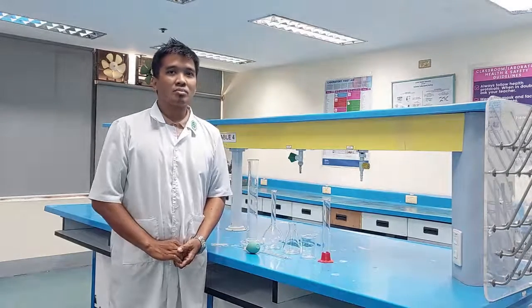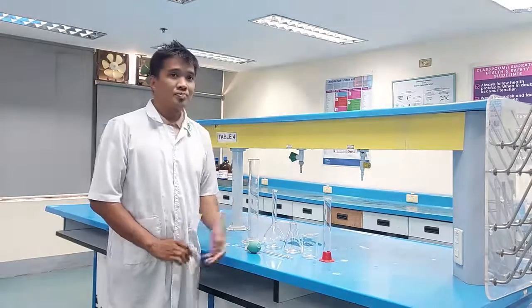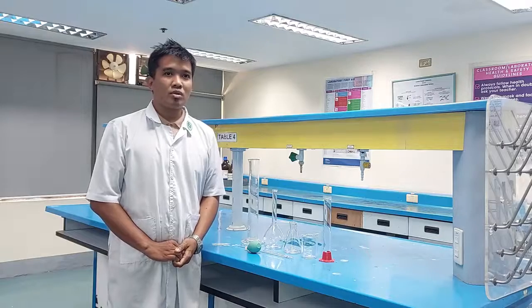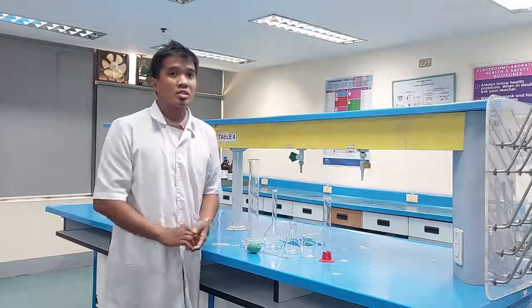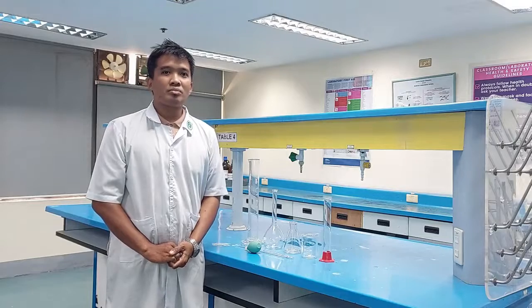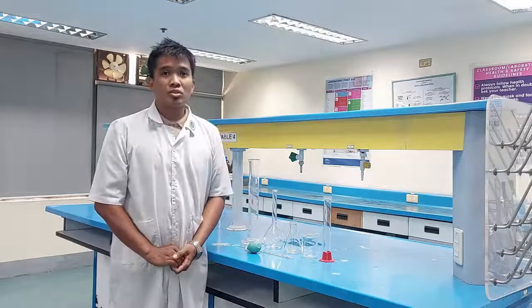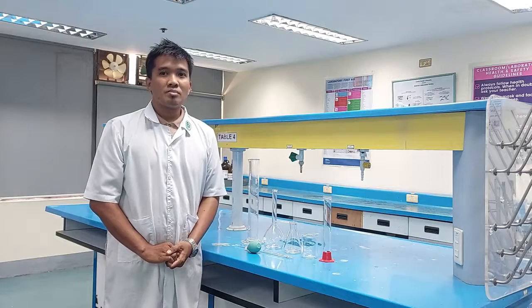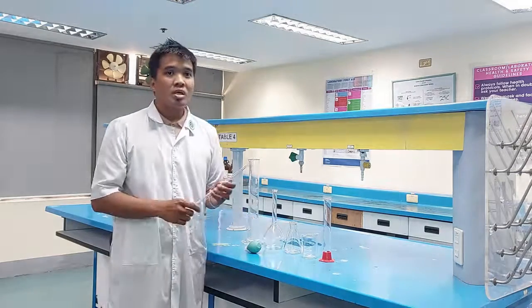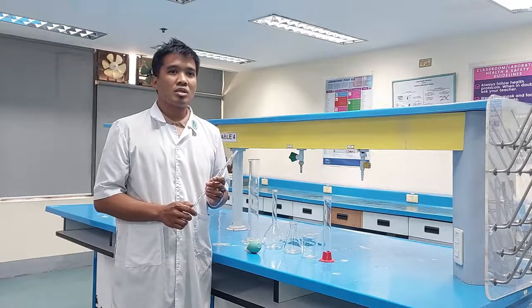The following are some of the tools used to measure volumes of liquid. Beaker, our least accurate instrument for measuring volumes. Graduated cylinders. Volumetric flask, used to measure a single predetermined volume. Erlenmeyer flask, used to measure approximate volumes, mixing, and sample storage. Pipettes, used to measure a volume of liquid that is being transferred to another container.